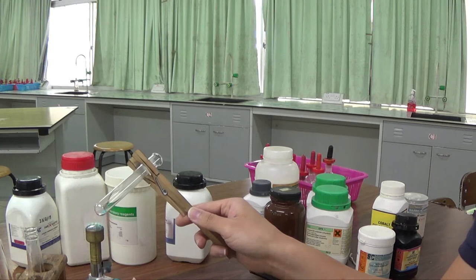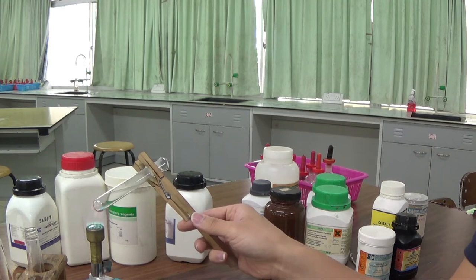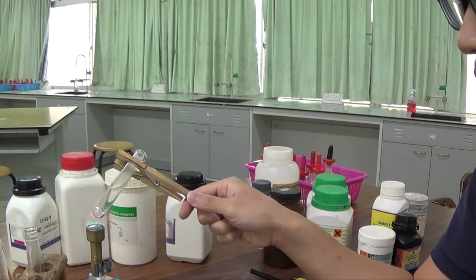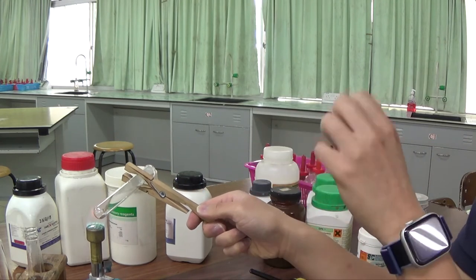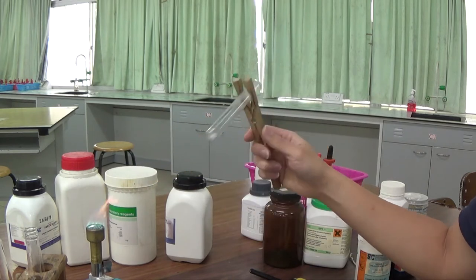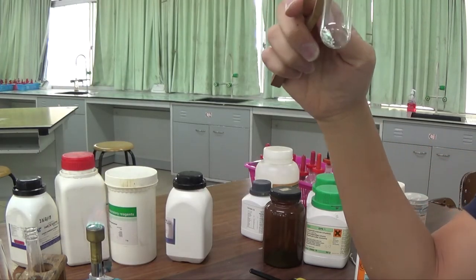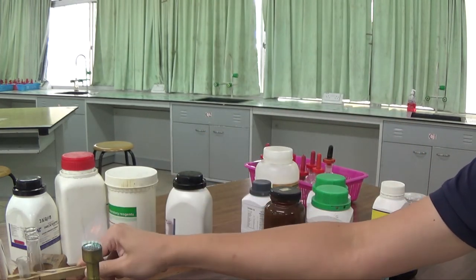The fire is not that strong. So I'm heating it a bit strongly now. And as I heat it more strongly, then all the water of crystallization will be driven off. Here it's very easy because you can see the color change. Whereas for the white colored solid, it's very difficult to tell if you have gotten rid of all the water or not, okay? So here you can tell that they already turned whitish. And they're already kind of stuck on the side, so I do not want to heat it even more strongly because I'm heating using a test tube and I do not want to break my test tubes, okay?